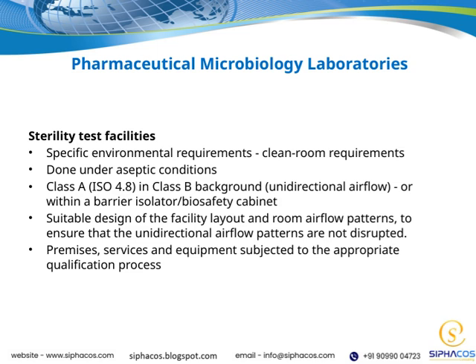Finally, all premises, services, and equipment involved in these processes must undergo qualification, meaning they are tested and verified to meet the required standards. This qualification process helps guarantee that every aspect of the environment and equipment supports a sterile, contamination-free testing process, aligning with our overall goal of ensuring product safety and quality.